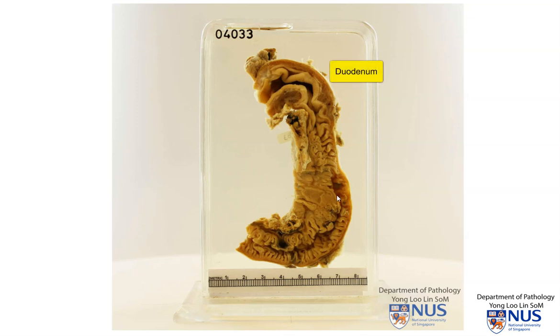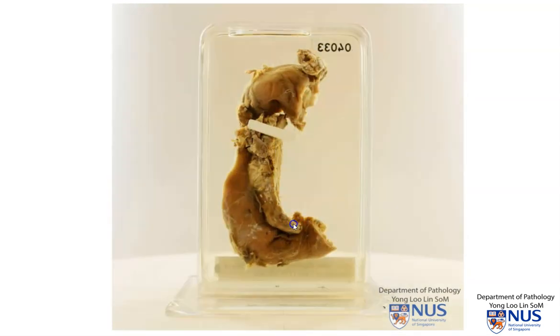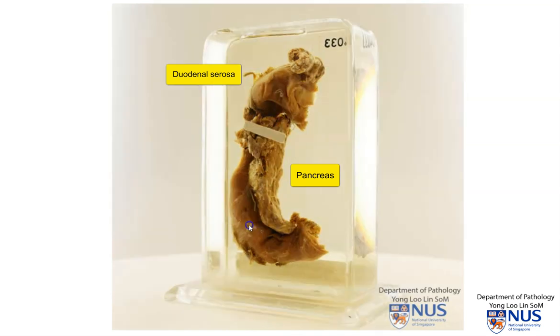We're looking here at the duodenum which has been cut open, and this little bit is just where the head of the pancreas and the ampullary region is. Turning this around, we can see the serosa of the duodenum, and this is part of the pancreas, and this is the cut margin of the pancreas.